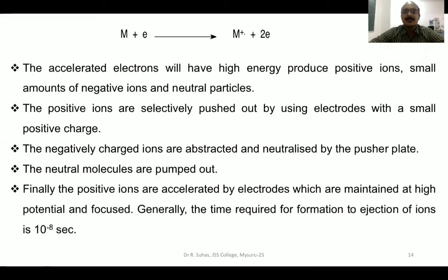Whatever we have studied or seen in the last two slides, everything takes place in just 10 raised to minus 8 seconds. That means the system is very, very fast with respect to the EI method.